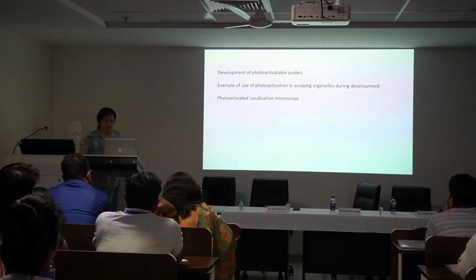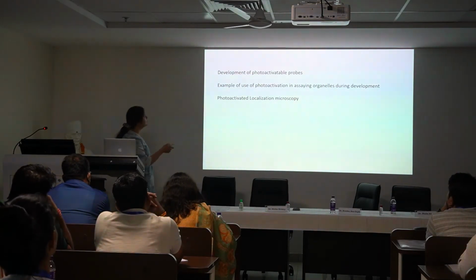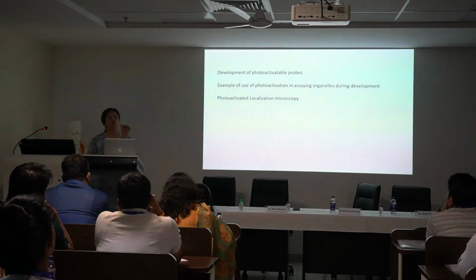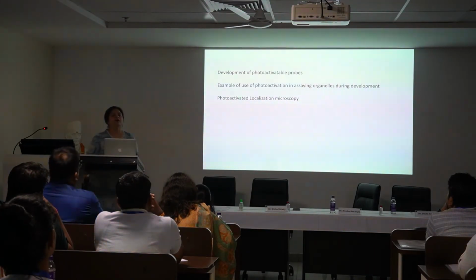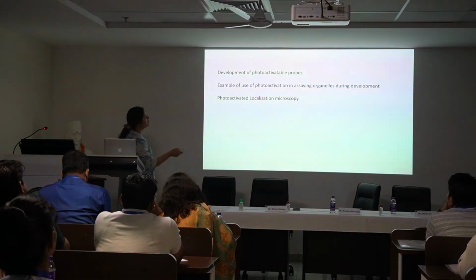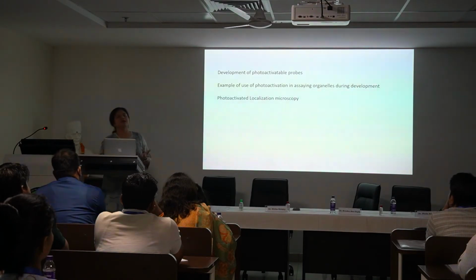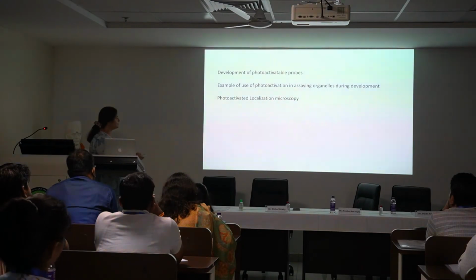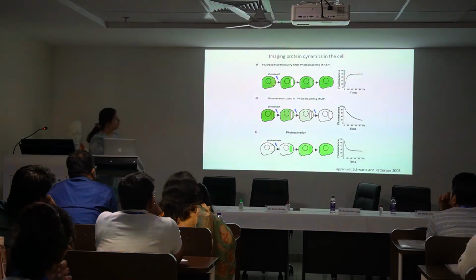Okay, so the main task for this, and you will obviously already realize, is the development of photoactivatable probes, right? So we want a probe which we can attach to the molecules inside the cell, which we can activate one at a time, right? That's the only way we can actually activate them sequentially. And what I'll do is, I will first tell you something about the development of this photoactivation tool. It's a wonderful tool just for you in live imaging. So since it's something that you will think of over and above super resolution, use this as an example, and then we look at its use in the photoactivated localization microscope.